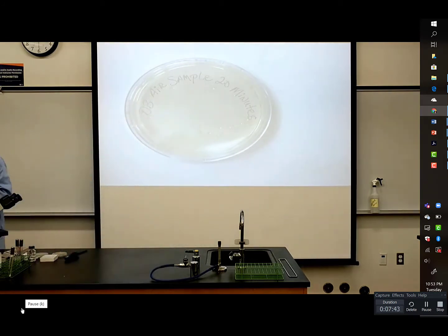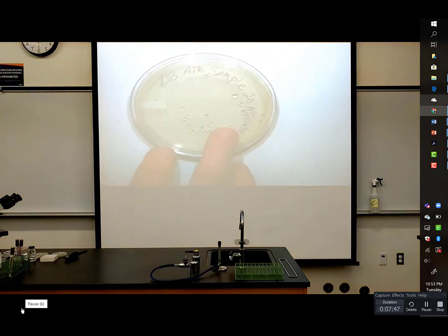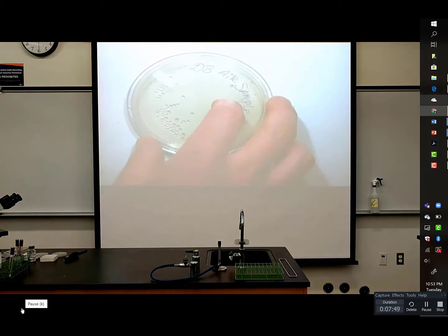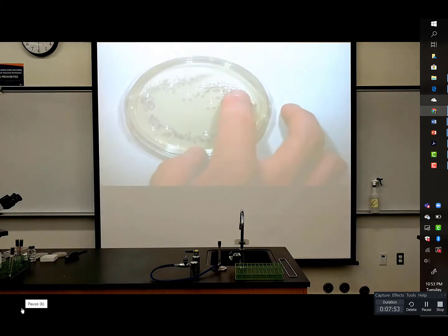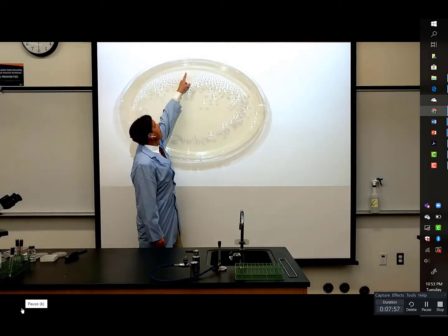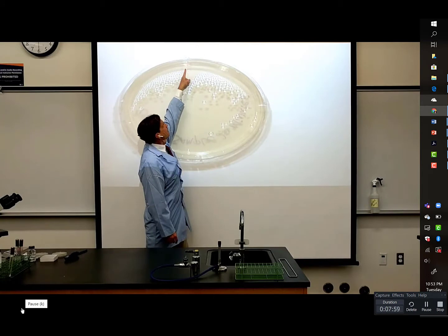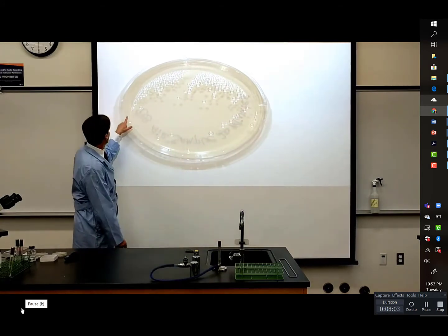I'm going to go ahead and turn the light on this, and maybe it'll give us a chance to see a little more readily. I'll flip it over for a second so you can see it from this angle. Okay, right up here, there are feet. There's a little line there and a little line there, one there and one over here.